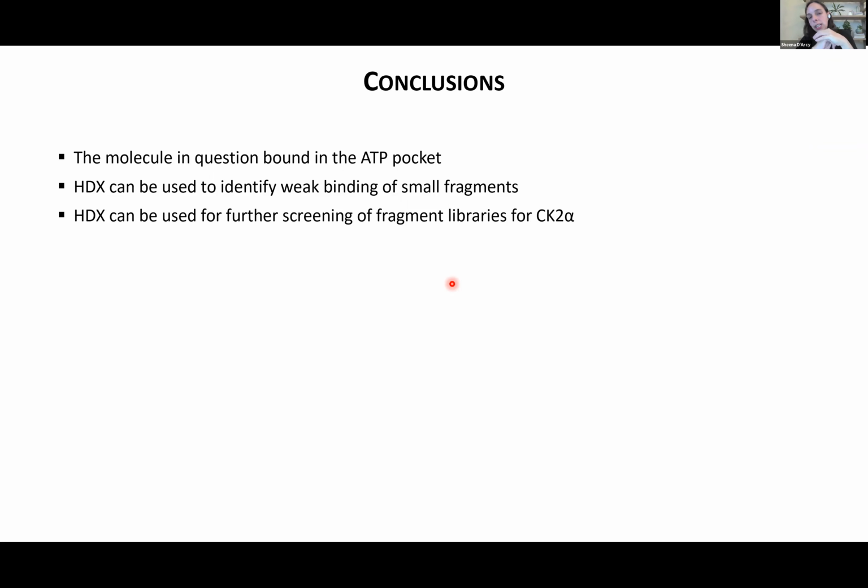But really it's just for a basic p-value test and visualizing. Because you have such large data sets, it can be good to use software just to create different types of figures really quickly. Okay, if there are no other questions, I'll move on to the second application.